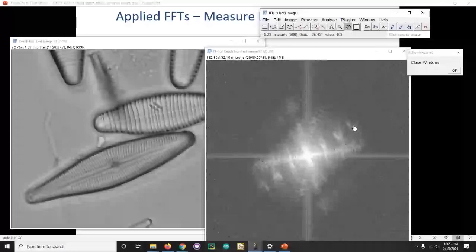And this is especially helpful if anyone does confocal imaging, where you can often run into an issue where your Z resolution is going to be a lot lower than your XY resolution. And so using these Fourier transforms, you can real quick address whether your resolution is isotropic or not.